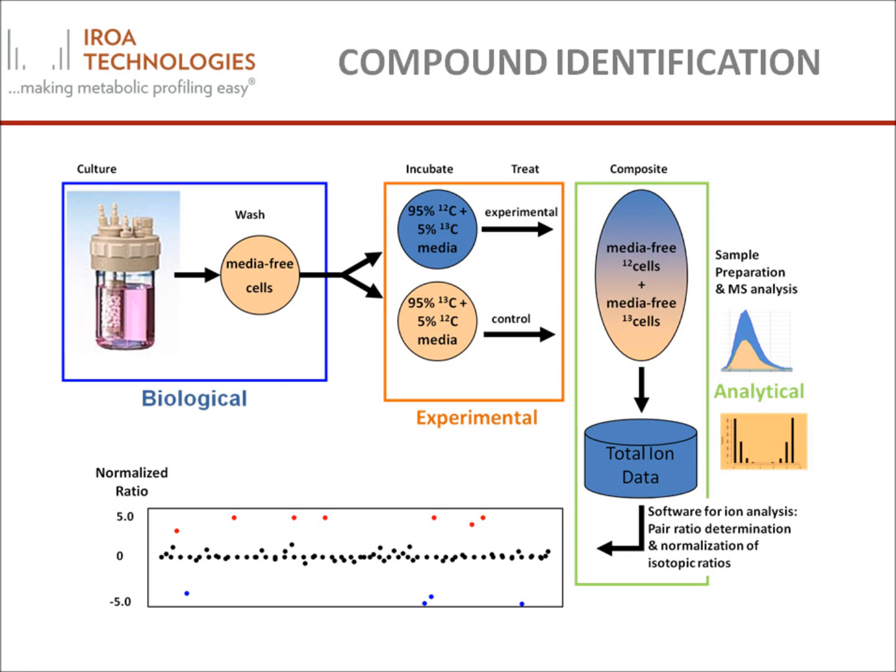One of the biggest advantages of the IROA methodologies is the accurate identification and quantitation of metabolites. This presentation shows how accurate compound identification is achieved using the IROA ClusterFinder software. The labeling procedure is discussed in the section How IROA Works.